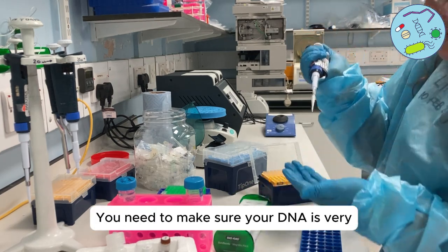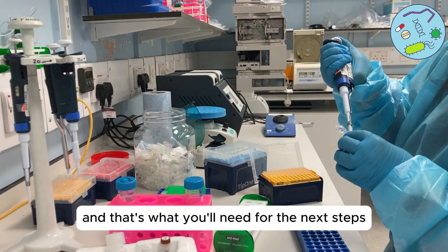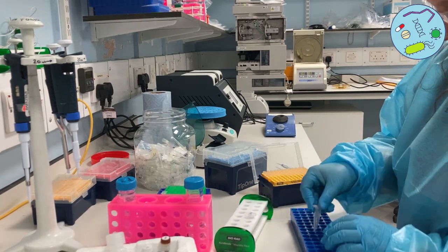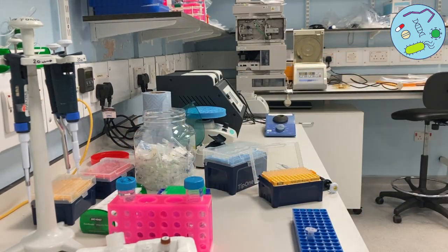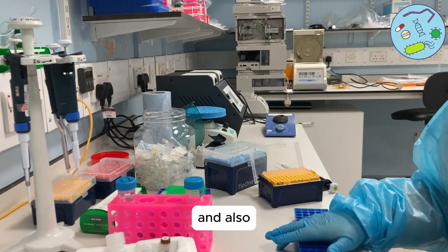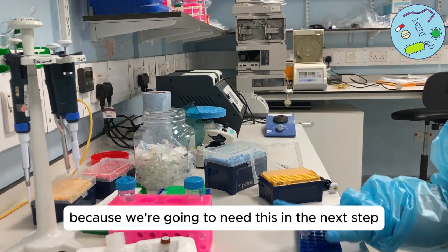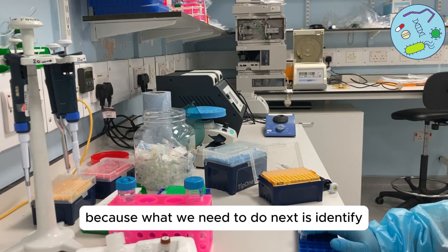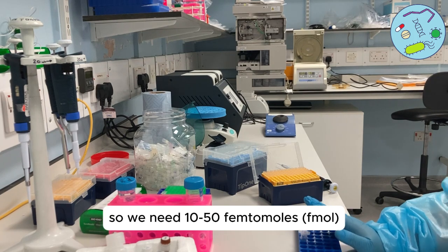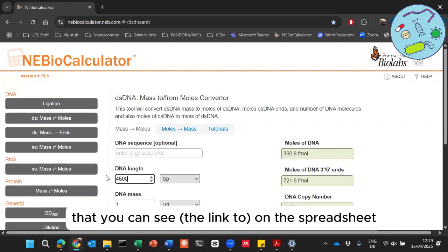Make sure your DNA is very clear — you can check it against a white surface. You need to use one microlitre to Qubit this to identify the concentration, and you also want to run a tape station, gel electrophoresis, or bioanalyser to identify the size of the DNA, because we'll need this in the next step. We need to identify how much DNA we've got to make up our final concentration — we need 10 to 50 femtomoles — and we're going to use the NEB calculator on the spreadsheet.